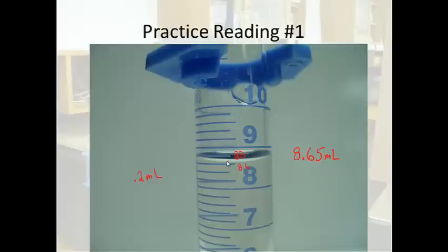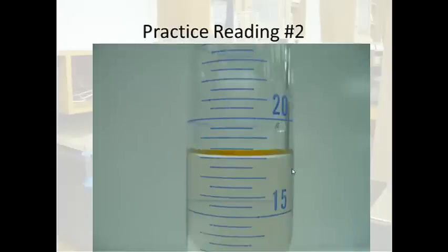If I thought it was exactly in between, if I thought the meniscus was right here, I would have said 8.70 milliliters. All right. One of the keys here is this: since this measures to the 10th place, I want to make my measurement out to the 100th place. We'll explain why that is later, but that's important for right now. All right, practice reading on this one.